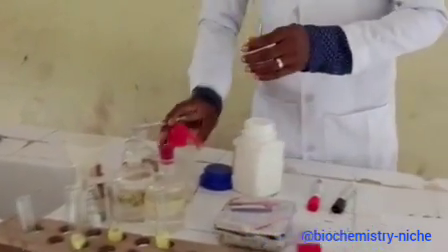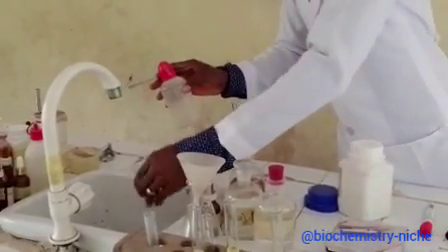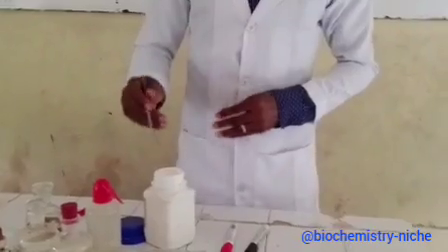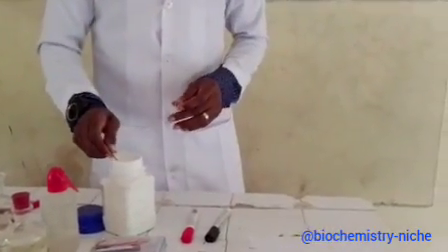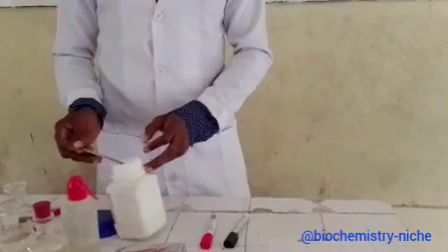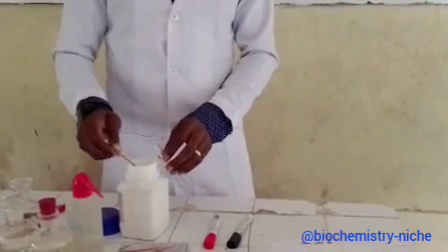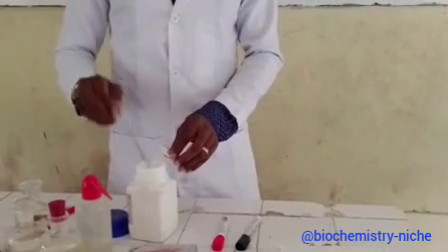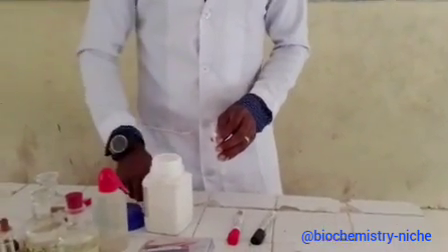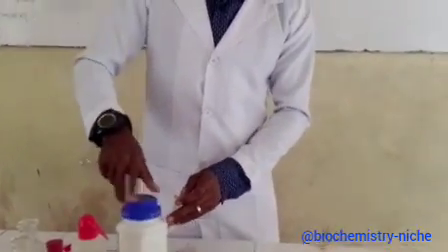Now, let's do this quickly because it's very important. Every test tube, your glassware, needs to be very clean. So, we have salt here. I'll be putting my salt into this now. Okay, this is the volume of salt that I'll be using for this particular experiment.